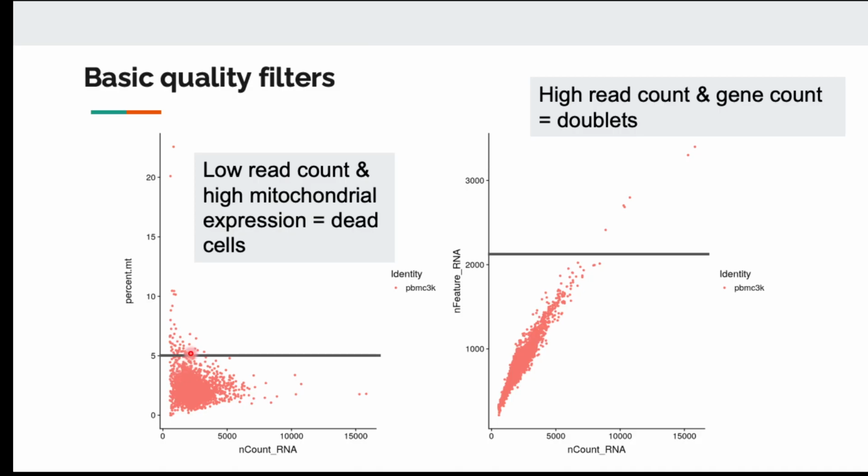So that's why people are not picky about where to put the threshold. But you should visualize the data and see if you have to put the threshold somewhere.